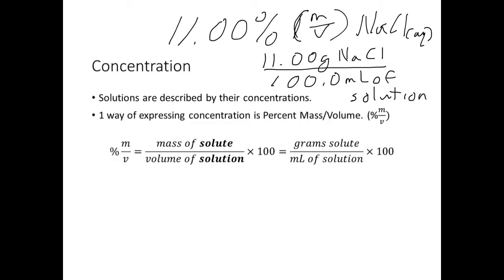A couple really important things to note about this formula. First and foremost, the bottom part here is the volume of not solvent, but solution.